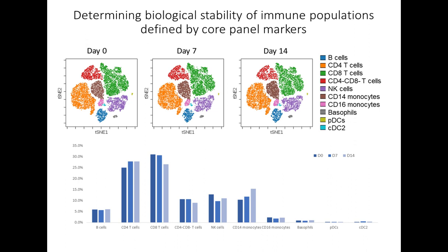And this helps us set thresholds beyond which we would want to look for changes in the case of our cohort. So essentially, we might conclude from this that a 3% change in monocyte frequency might just be part of normal biological variation, whereas perhaps a change of 20% is going to exceed that normal biological variation and reflect something interesting that might be happening in that cohort.